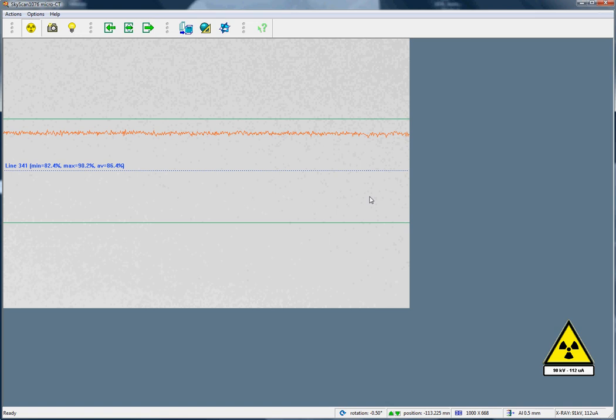In the 1076 scanner we have 4 different filters and 3 resolution levels, which gives us 12 scanning modes.